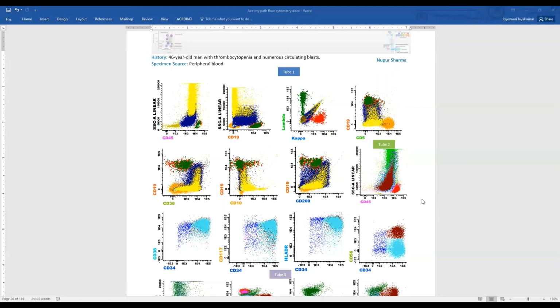Now, there is an entity in myeloid leukemias which can express CD19, which is AML with translocation 8;21. So these 8;21 AMLs express partial CD19, and CD19 is not the only B cell marker they will express. They can express actually all the B cell markers like CD79, PAX5. So, you know, even if you perform IHC, it's not going to distinguish the two populations. So the only thing that can help here is the intensity of CD19, and then there is a bright, homogeneous, unequivocal expression of myeloid markers.